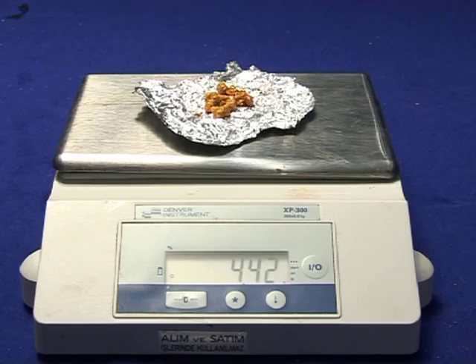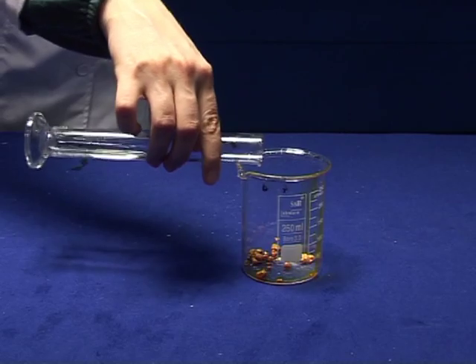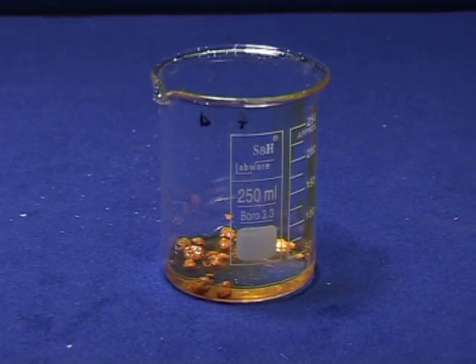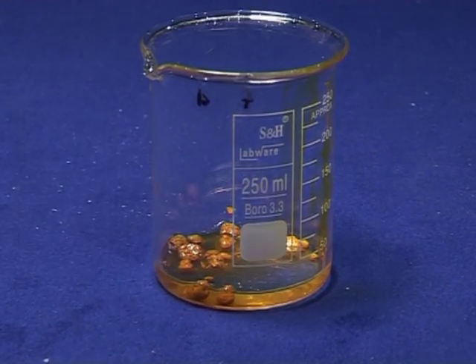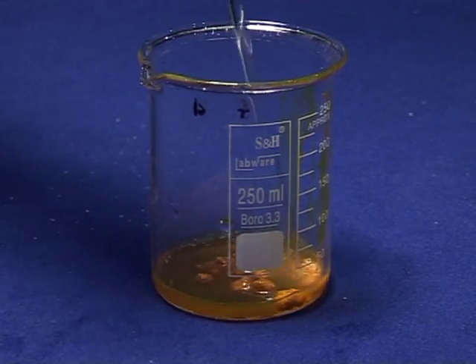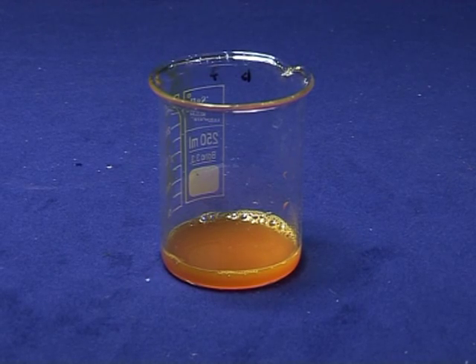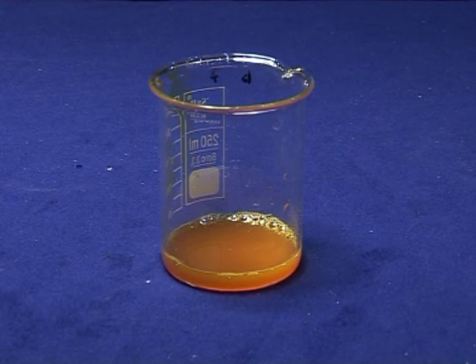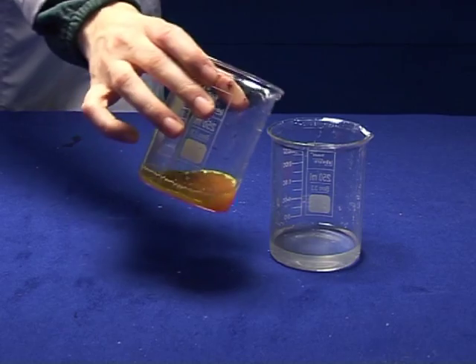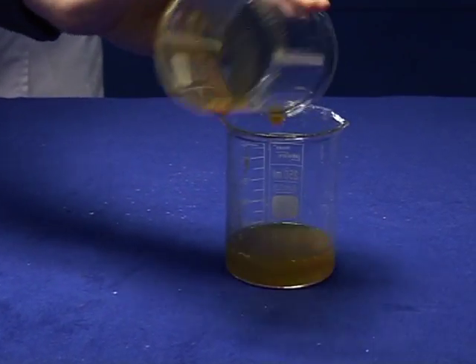In another beaker, dissolve 4.4 grams of ferric trichloride hexahydrate in 10 to 15 ml of cold water. Add the ferric trichloride hexahydrate solution to the warm oxalate solution and stir with a glass rod.